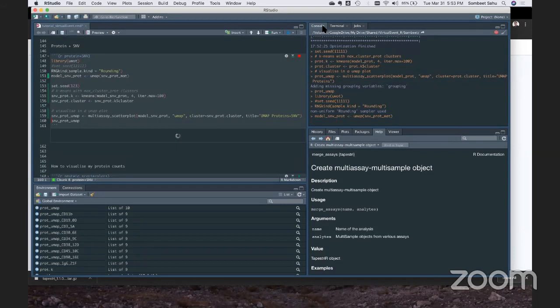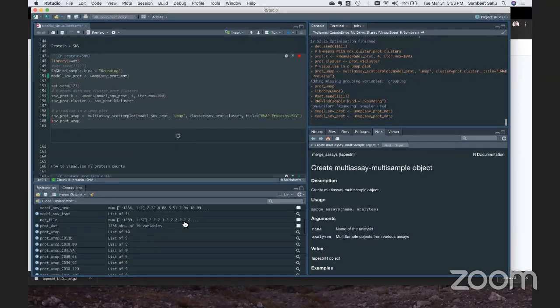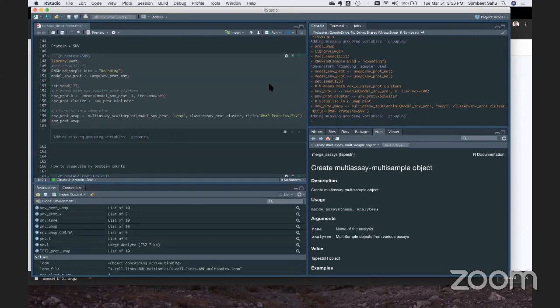Just a question from the audience. What percentage of dropouts or unknown genotypes do we have in this data set? I just answered that. So based on the filtering, that would change, as I mentioned.